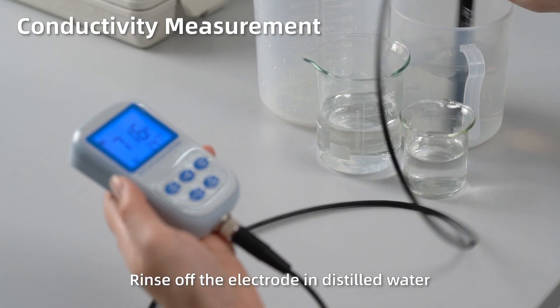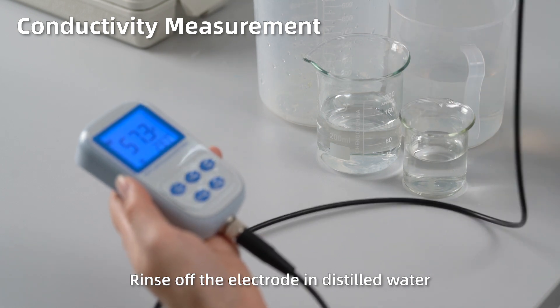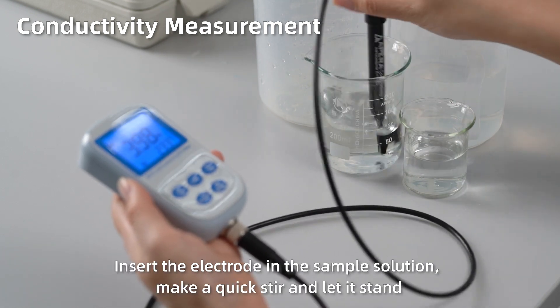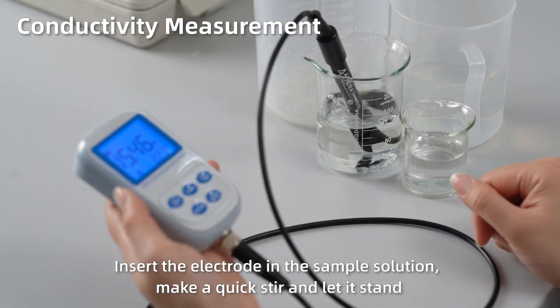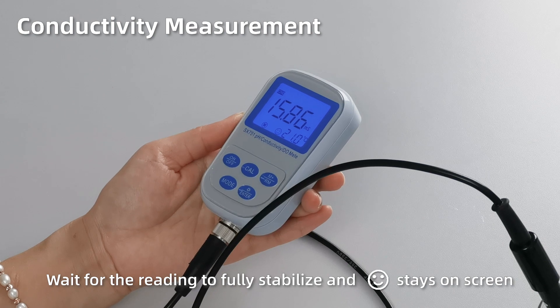Conductivity measurement. Rinse off the electrode in distilled water. Insert the electrode into the sample solution. Make a quick stir and let it stand. When the reading is fully stabilized and the smiley face stays on screen, the measurement is ready.